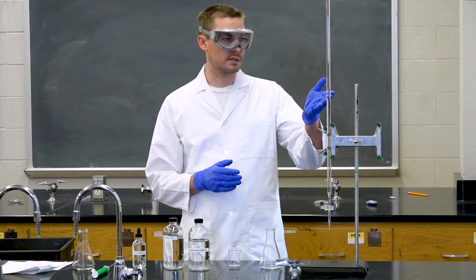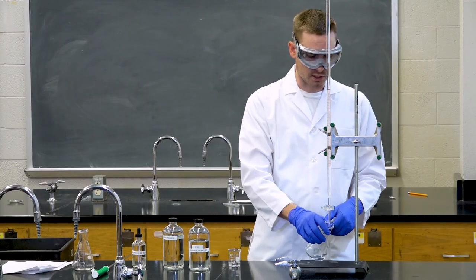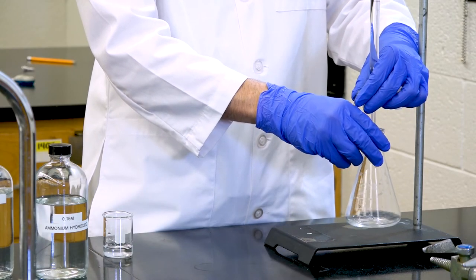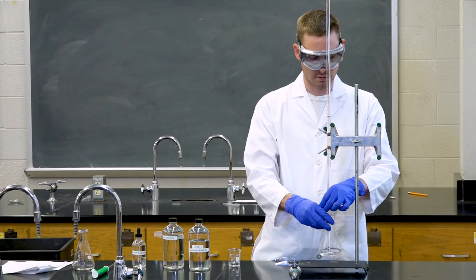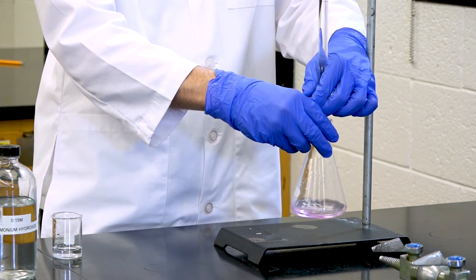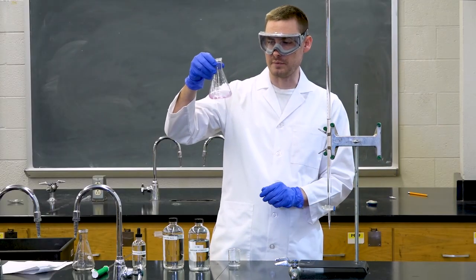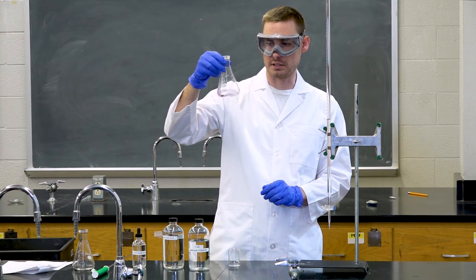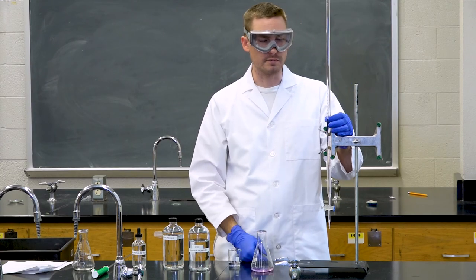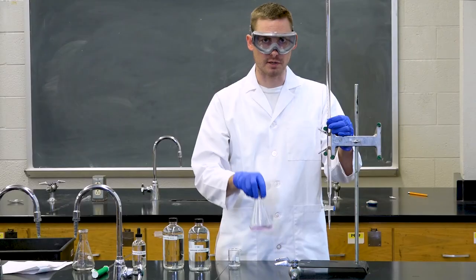And then after recording the starting volume of our titration, we can begin to add base to our sulfuric acid solution. Once we have reached this faint pink color, we know that the reaction has come to its end. We can then record our ending volume on our burette, and subtracting the initial volume, we can then find how much solution we have added to our flask.